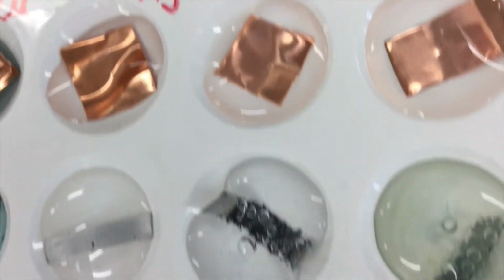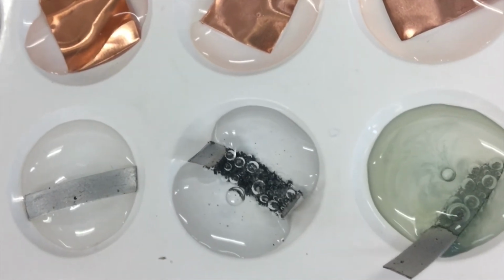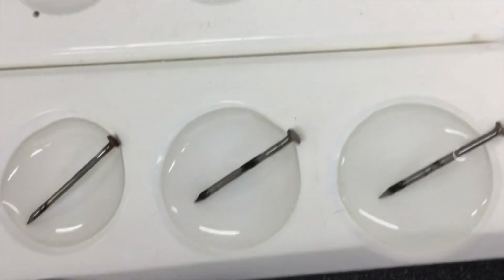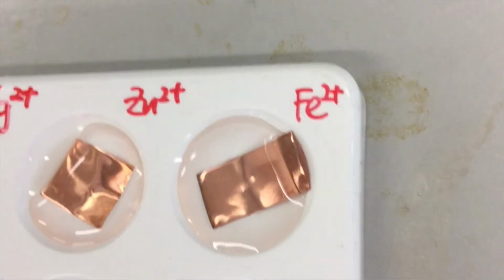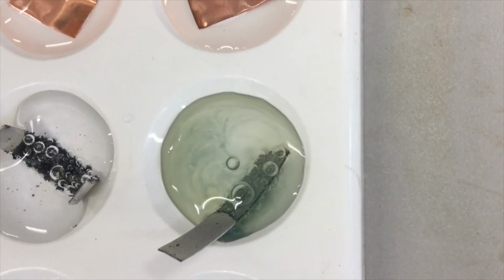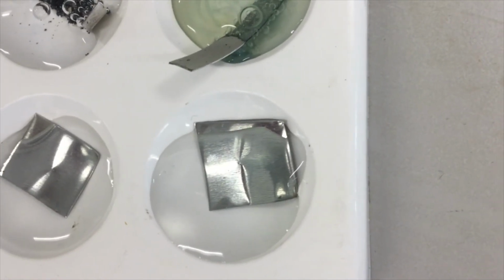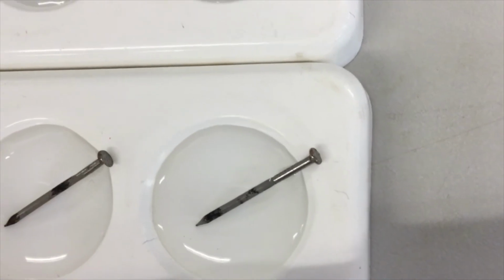Consider the third vertical column with zinc sulfate solution. Magnesium gives colorless bubbles and black solid, while the other three metals do not give an observable change. Moving on to the last vertical column where iron-2 sulfate solution is added, magnesium gives out bubbles and black solid. For zinc, it seems like there is no observable change. And lastly, iron does not give any observable change.